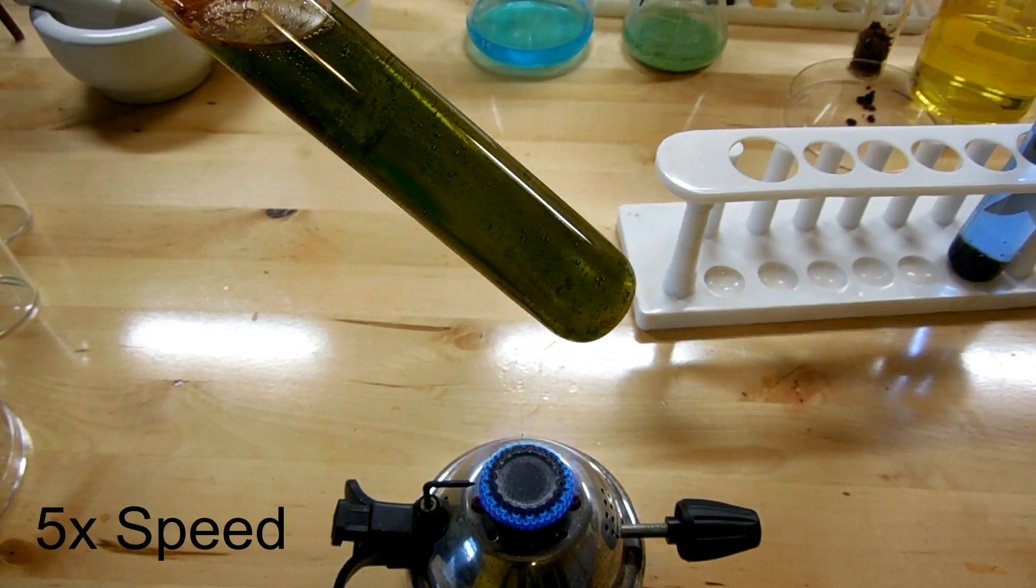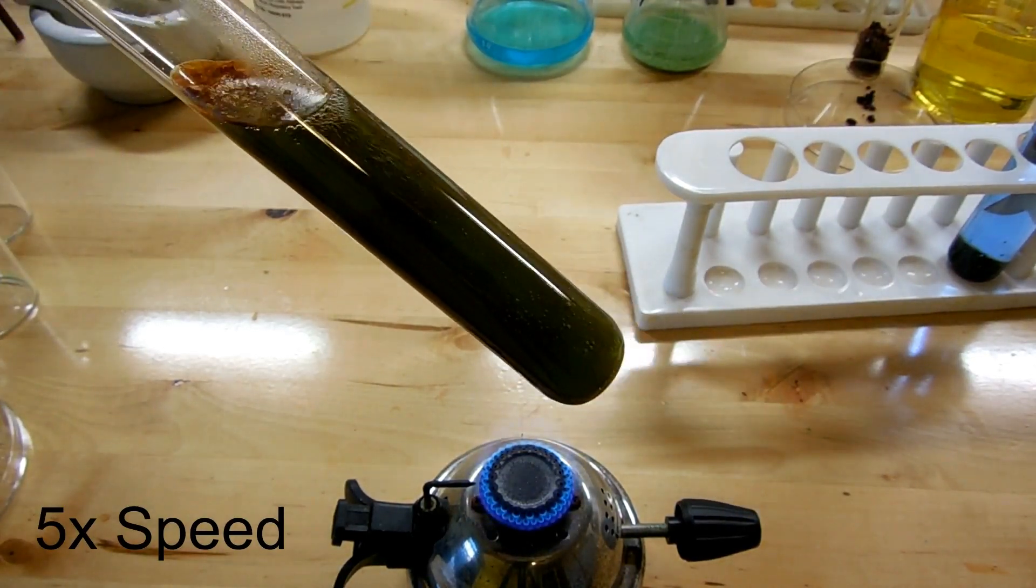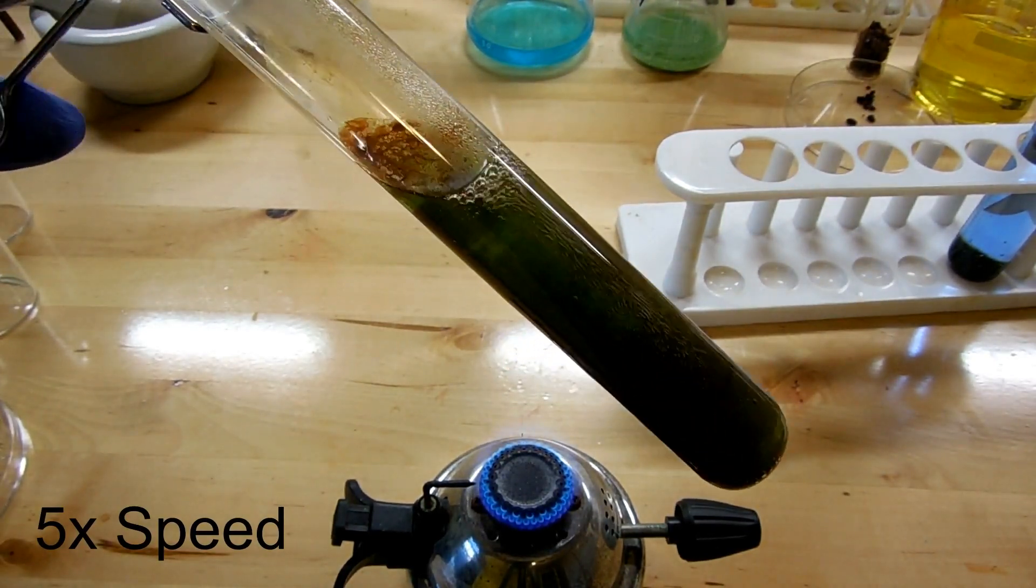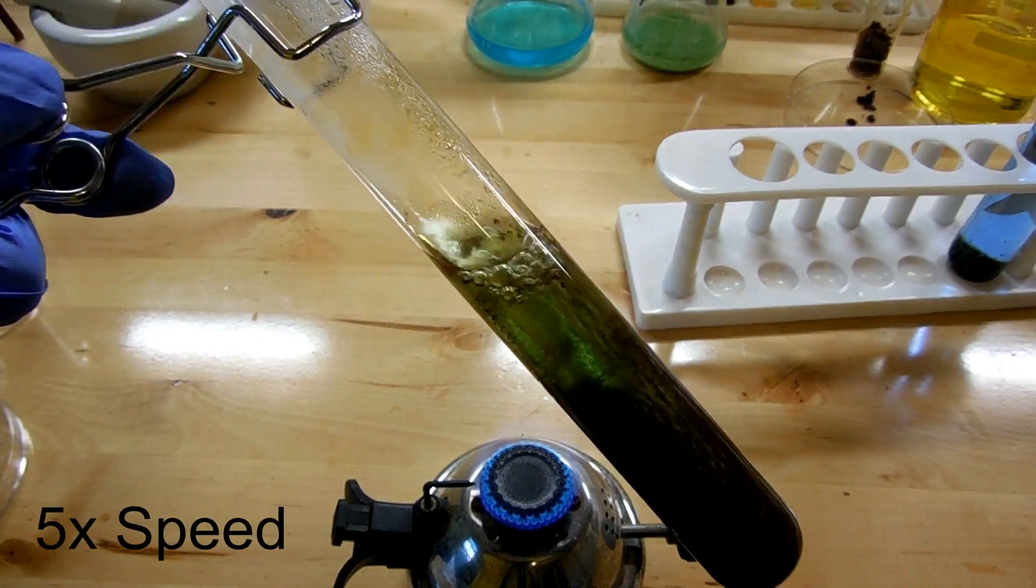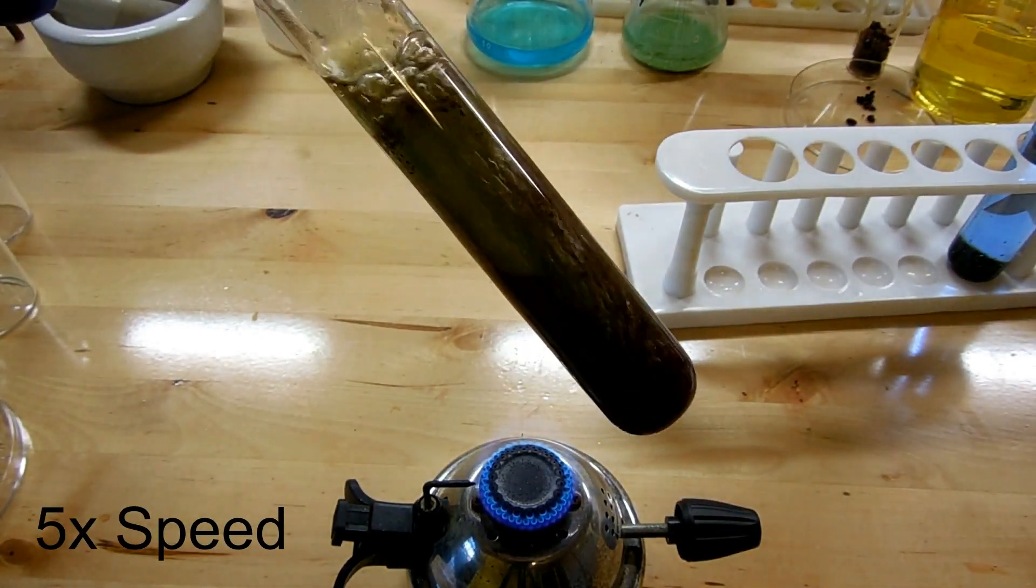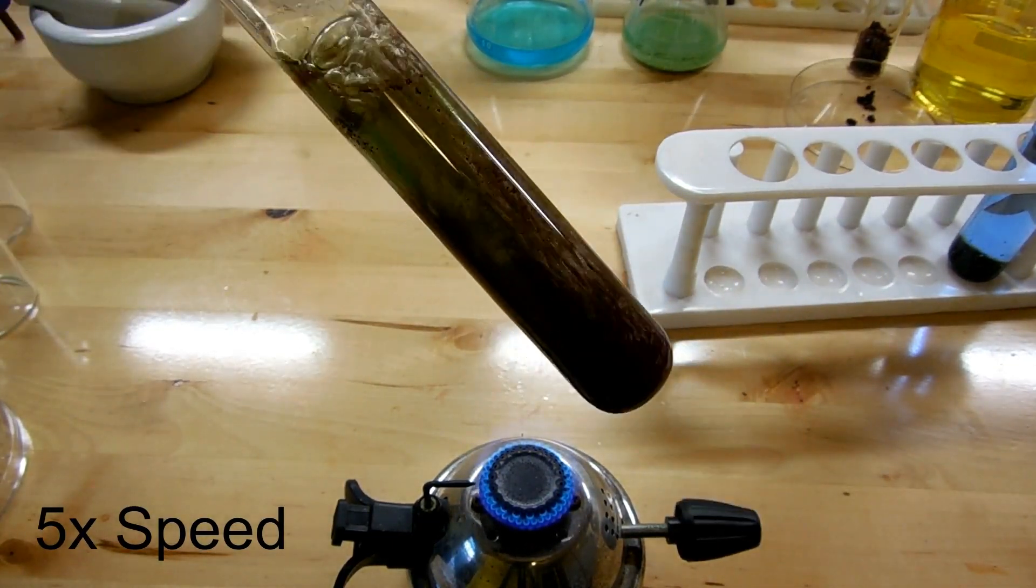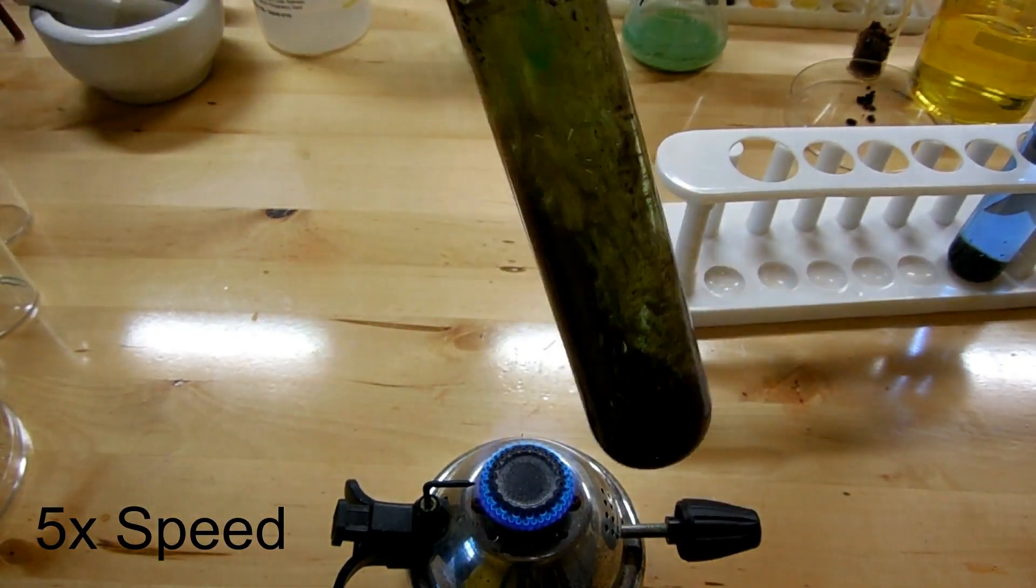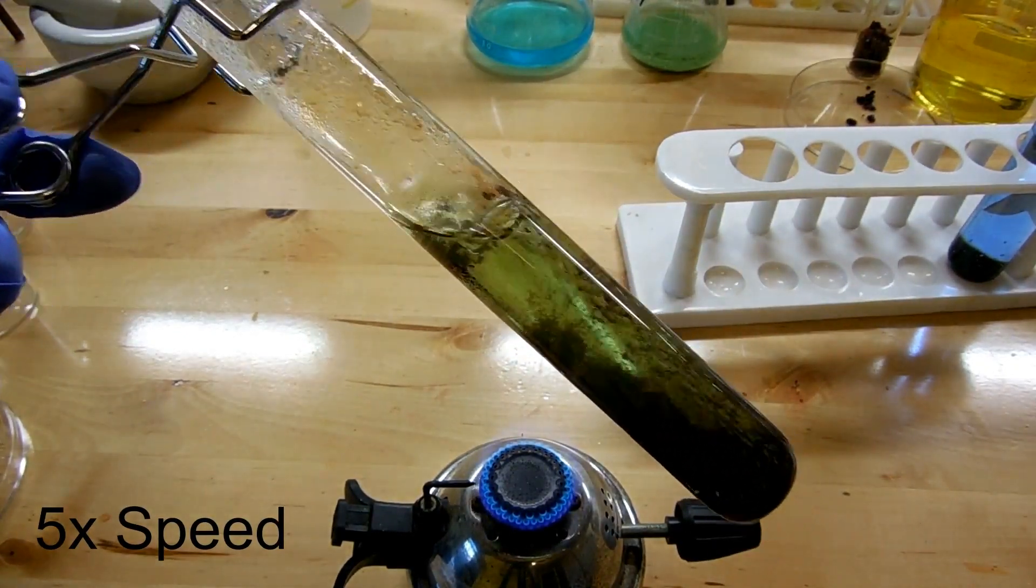As we're boiling this solution we're getting the Chevreul's salt to precipitate as a brick red solid. Now red colors are very rare for copper compounds. There's really only one other one that I know of that is red and that's copper one oxide. So you can see as we heat this we get a very dense crystalline precipitate that falls right to the bottom of the test tube. So it's really easy to recover this in the end.